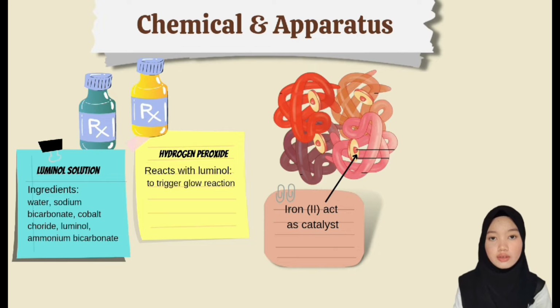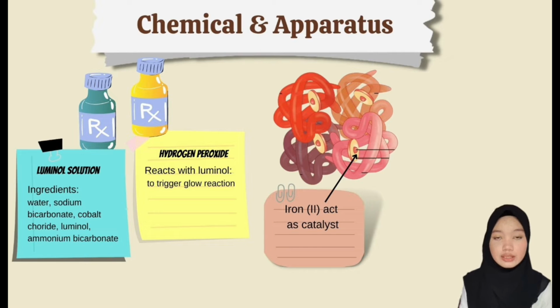Now we will talk about the methodology and the mechanism behind how luminol works. The central chemical in this reaction is luminol, a powdery compound made up of nitrogen, hydrogen, oxygen, and carbon. Criminalists mix the luminol powder with a liquid containing hydrogen peroxide and other chemicals, and pour the liquid into spray bottles. The hydrogen peroxide and the luminol are the principal players in the chemical reaction, but to produce a strong glow they need a catalyst to accelerate the process. So the mixture is actually detecting the presence of such a catalyst, in this case the iron in hemoglobin.